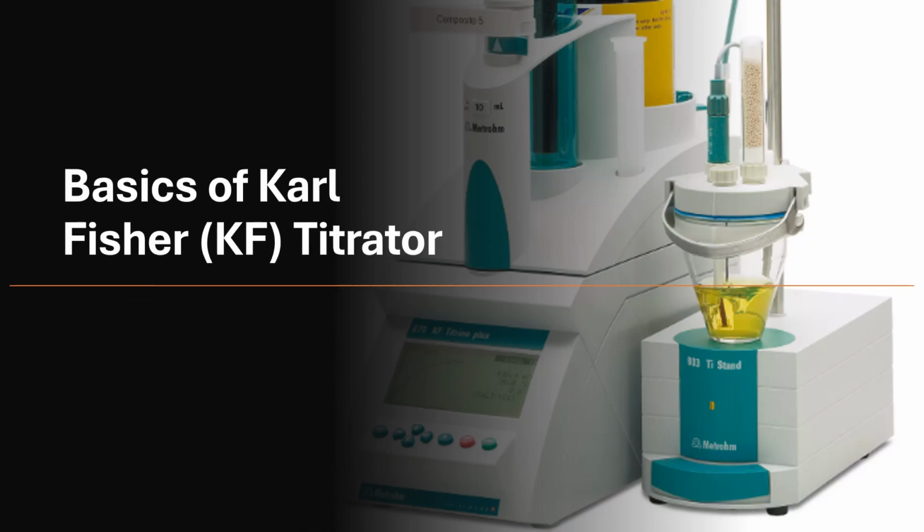Today we are talking about a widely used chemical analysis technique that plays a key role in labs across various industries, mainly in the pharmaceutical industry. That is the KF titrator, or Karl Fischer titrator.